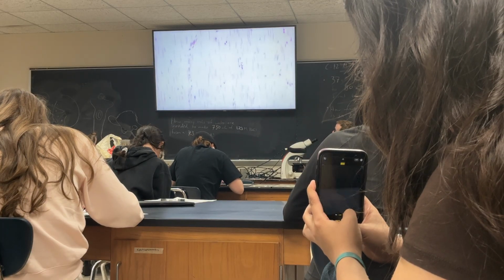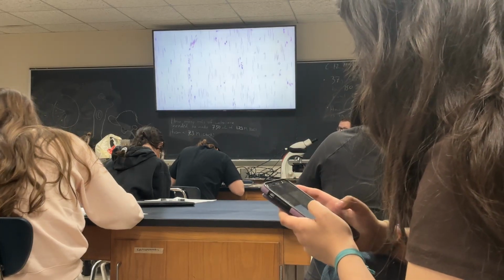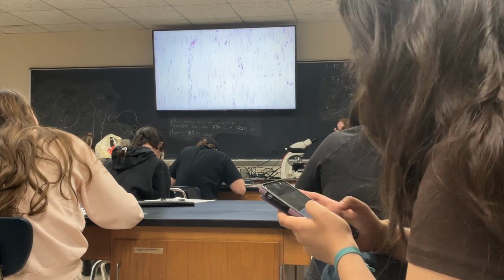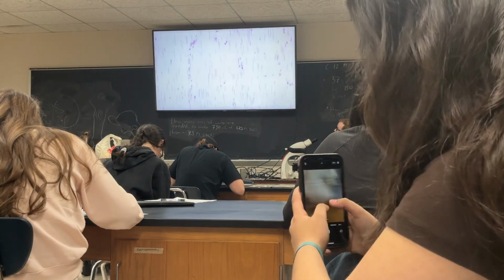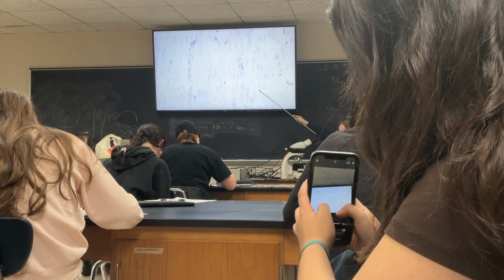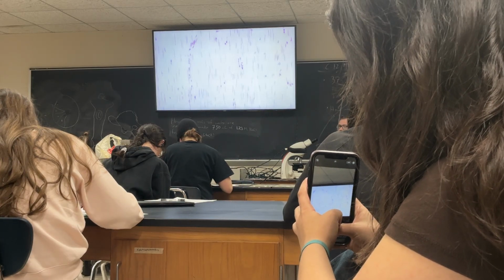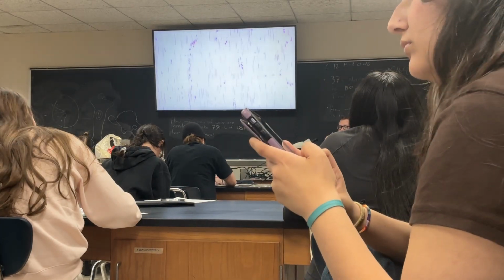There's just way too many cells for this to be a connective tissue. Connective tissue overall does not have that many cells per square inch. Here's a ton of nuclei, which means there's a ton of cells here. And these nuclei, I agree, are still like pancakes, but they're a little bit more oval instead of thin little strips like we just saw with the dense regular. Should I go back to the dense regular so we can compare?